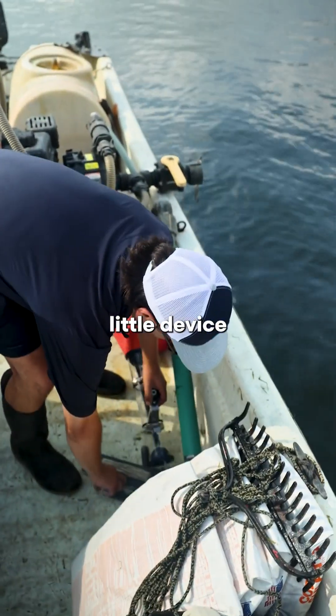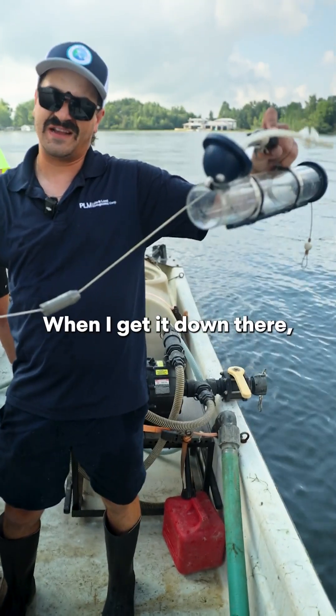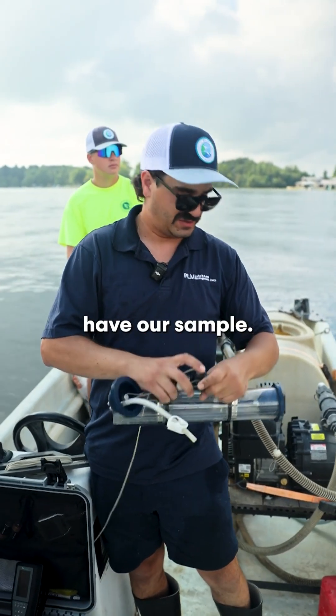We have this neat little device called a Van Dorn. There's a little sliding weight on here, and I'm going to set it at seven meters. Once it's down there, I'll launch the weight down like a little grenade — it'll close these caps and capture the water beneath the thermocline for us, and then we'll have our sample.